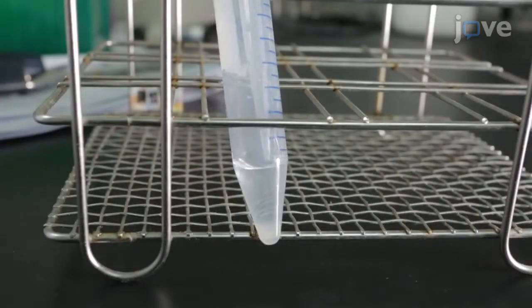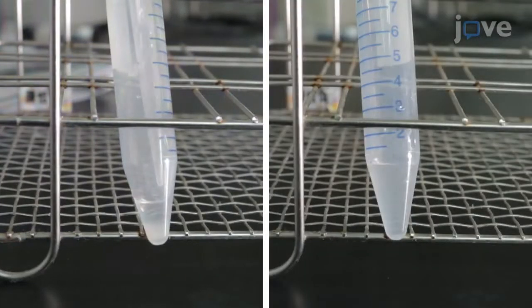After centrifuging the worms, remove the supernatant and keep the worms in 3.5 mL of deionized water.